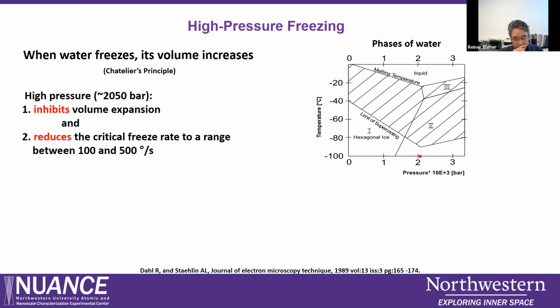So we have seen the limitations in sample thickness that apply for the plunge freezing technique. There is one way to overcome this hurdle, and that is the application of pressure to samples while they are being frozen. This approach is based on the well-known fact that when water freezes, its volume increases. This is based on Le Chatelier's principle, which states that changes in the temperature, pressure, volume, or concentration of a system will result in predictable and opposing changes in the system in order to achieve a new equilibrium state.